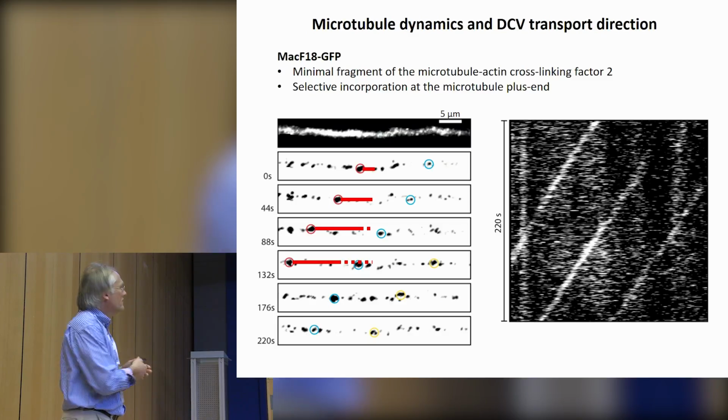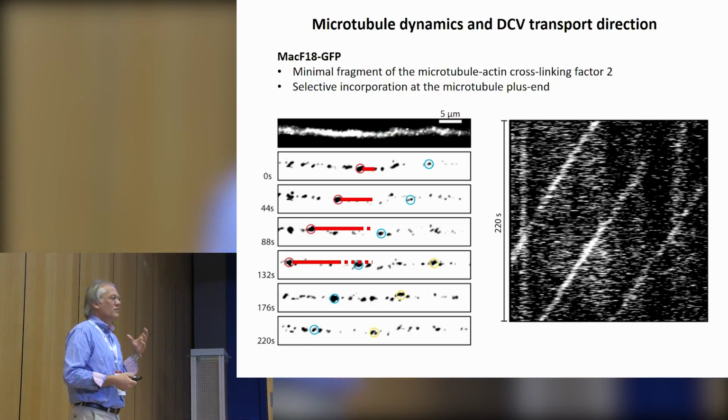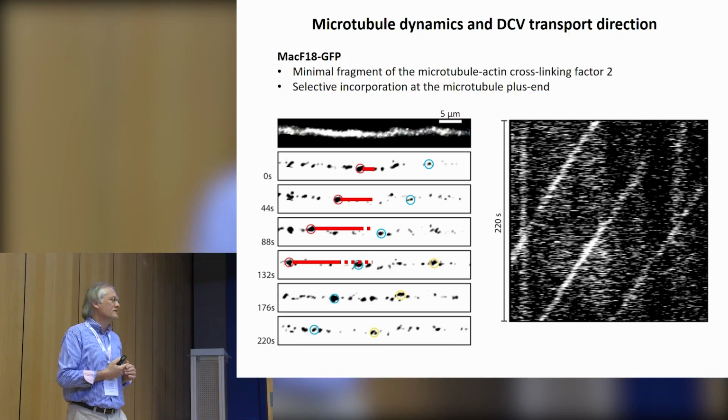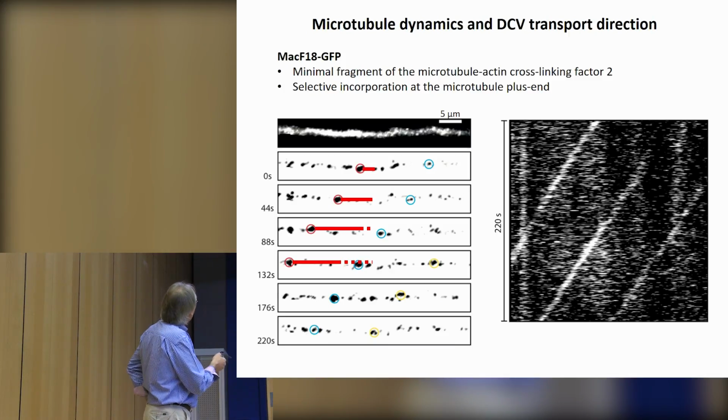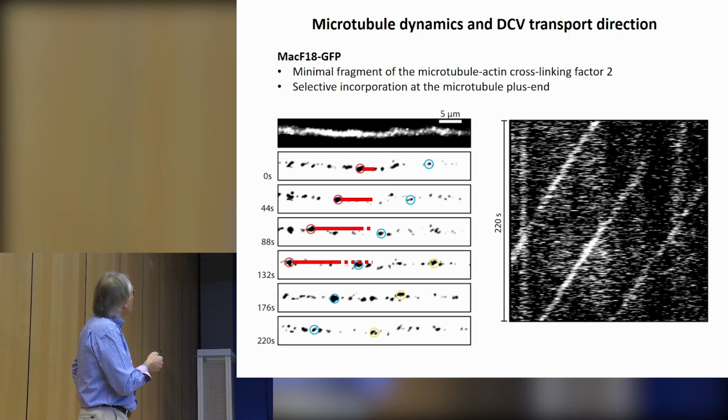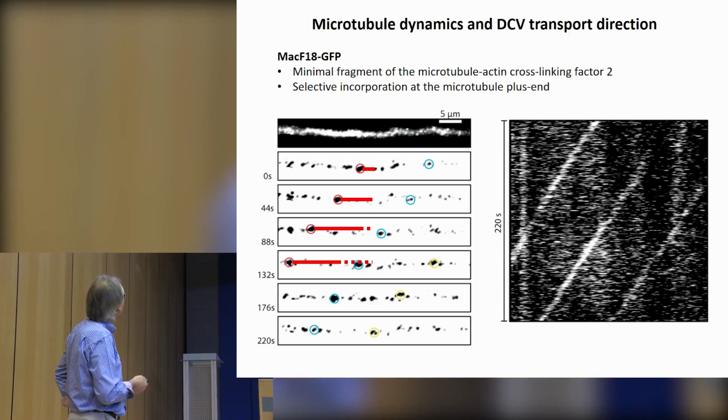But of course, you only see the signal where the plus end extension is taking place. So basically, this is showing us the direction of microtubule production in this axon. So from this data here, we can now say, well, this is the minus end and this is the plus end of that axon stretch. And of course, you can do these kinds of kymographs again. And you can see the lines are pretty steep, meaning that's very slow transport here. Some of them are just residing at one position as shown here.